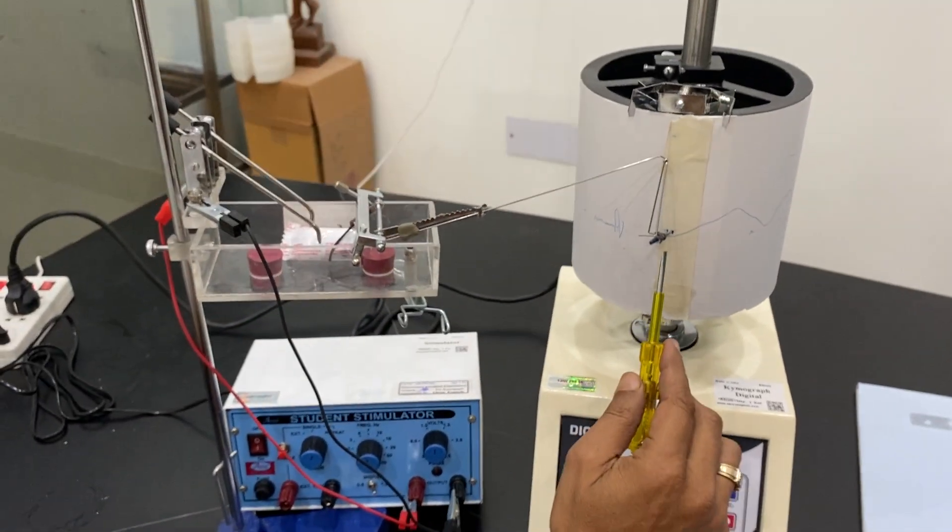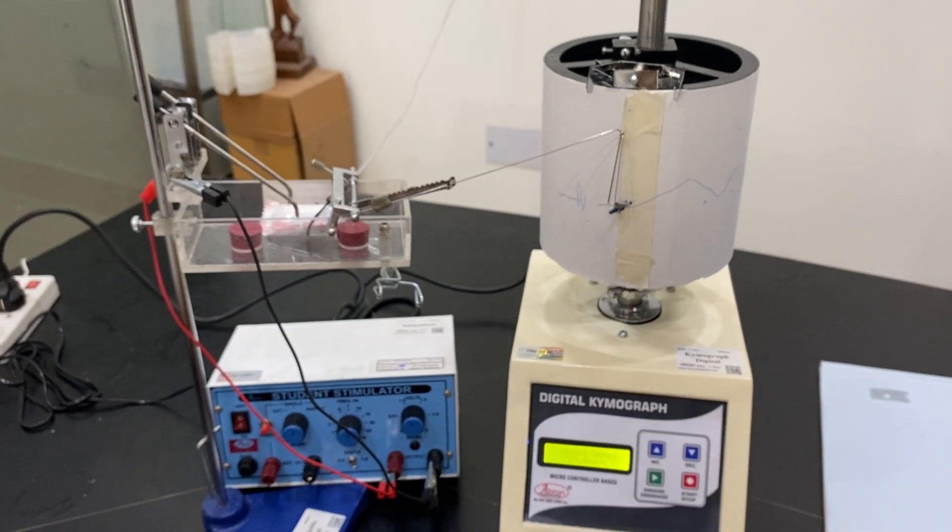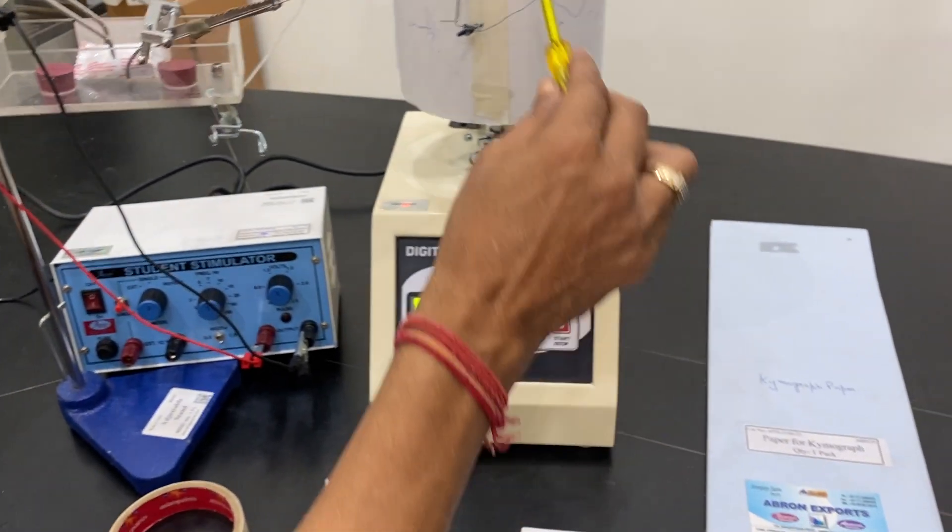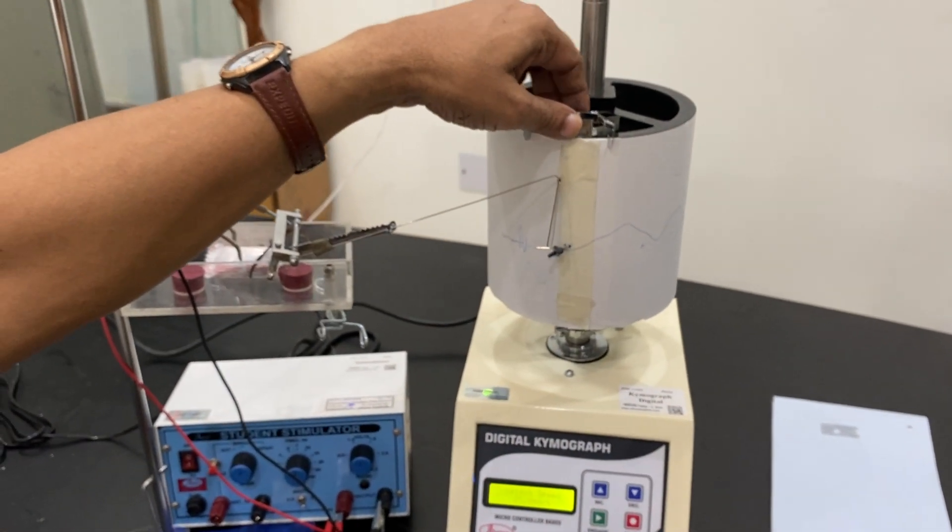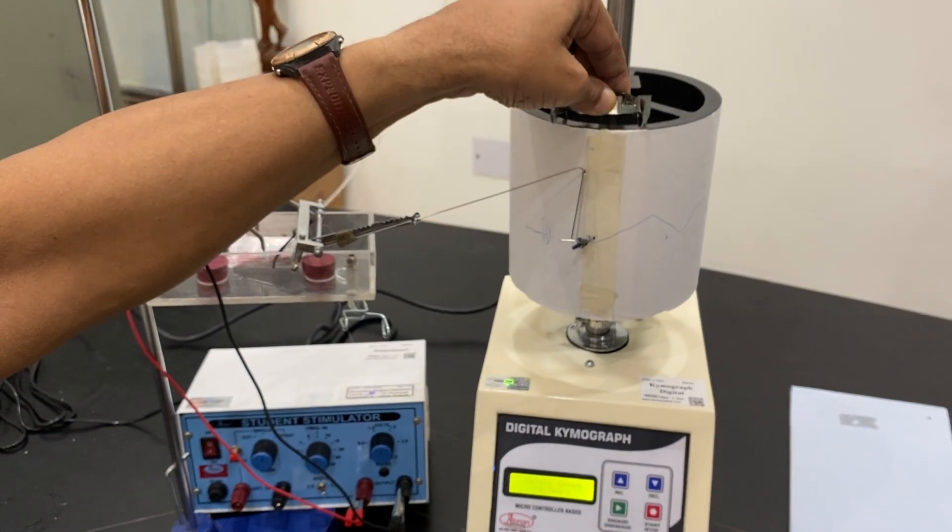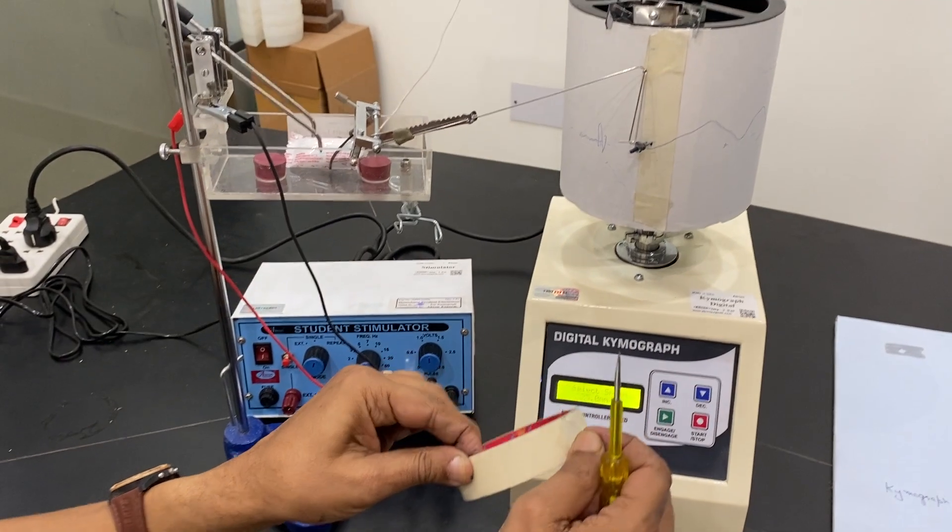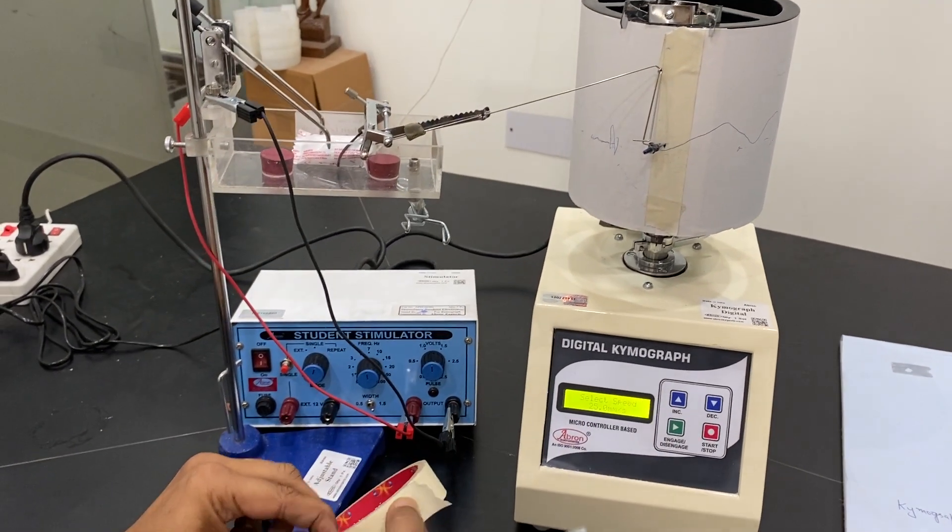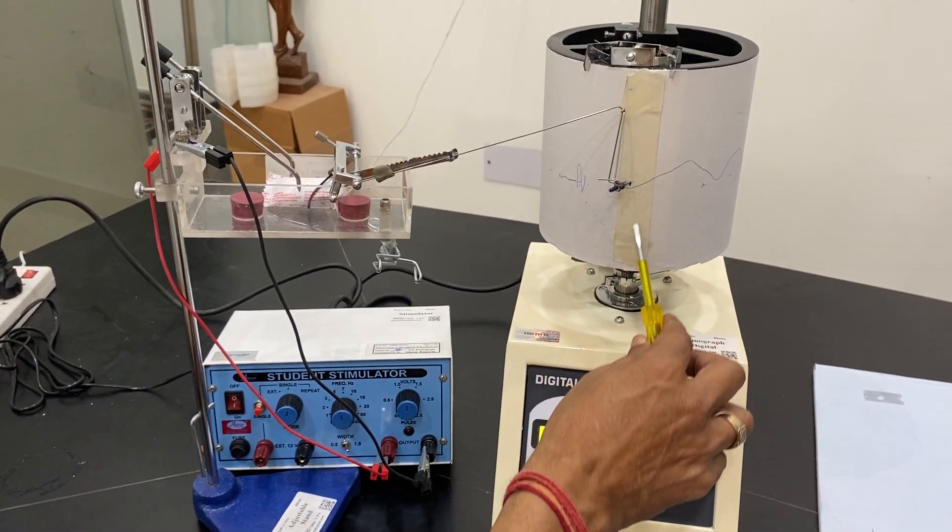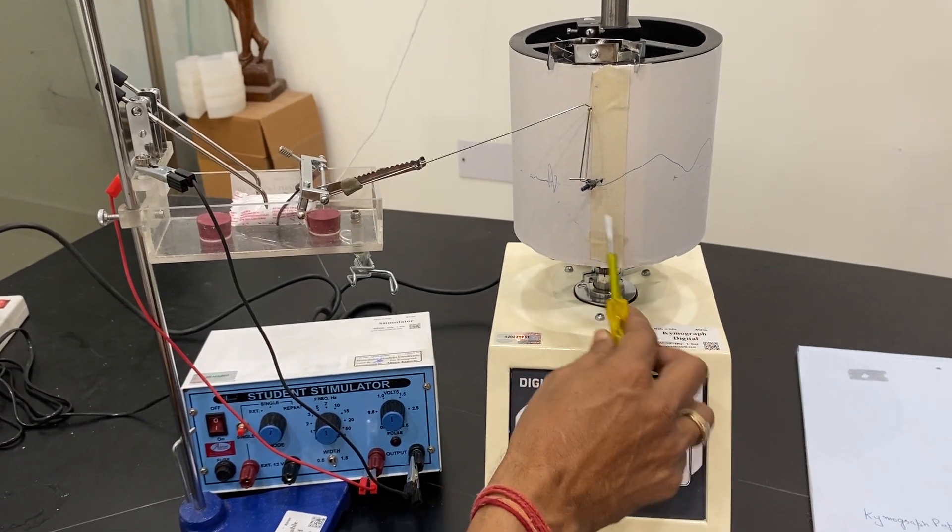Now this frontal lever will, the paper is attached. We have got the Kymograph paper and it is attached with the recording drum with the clip. But I have used a paper tape which is available in the market locally also in your area maybe.